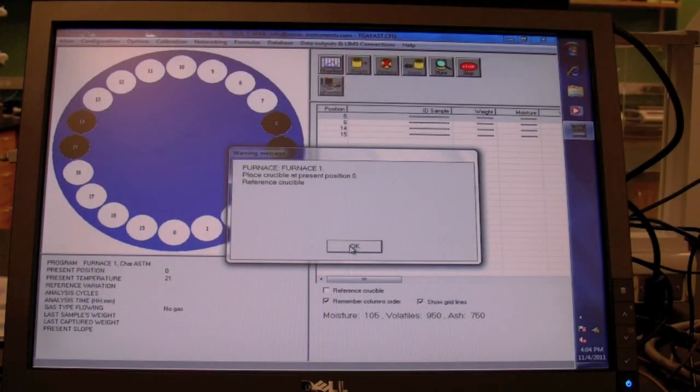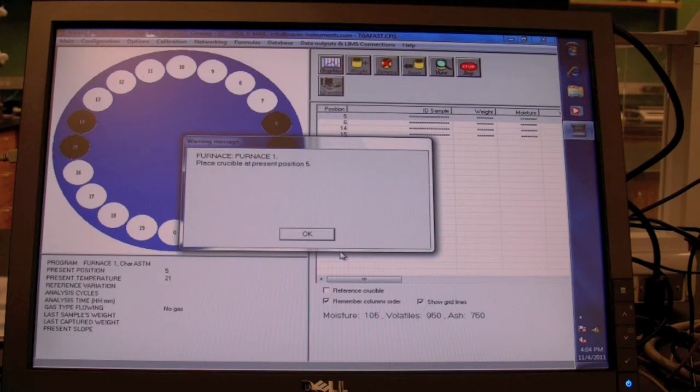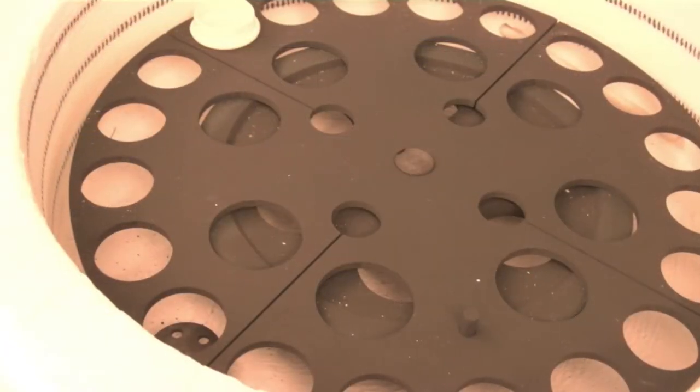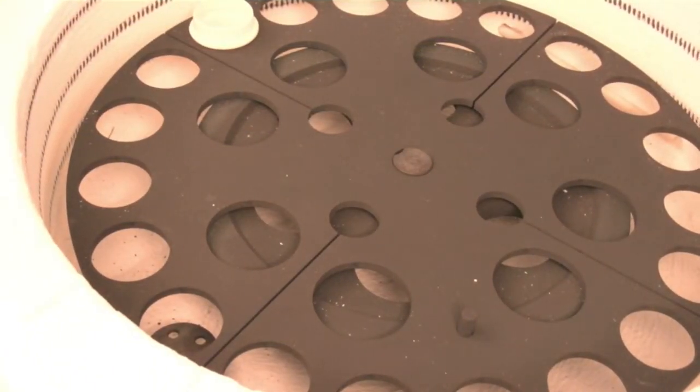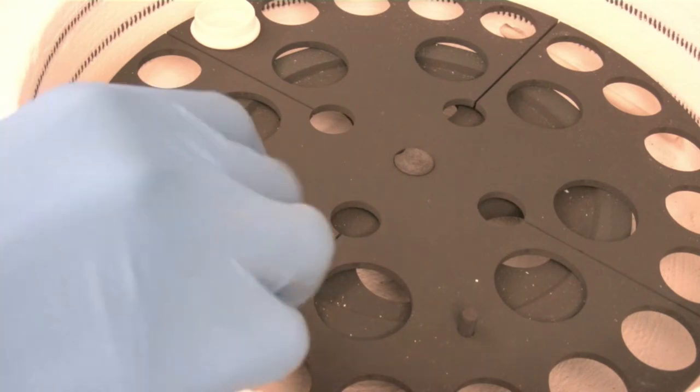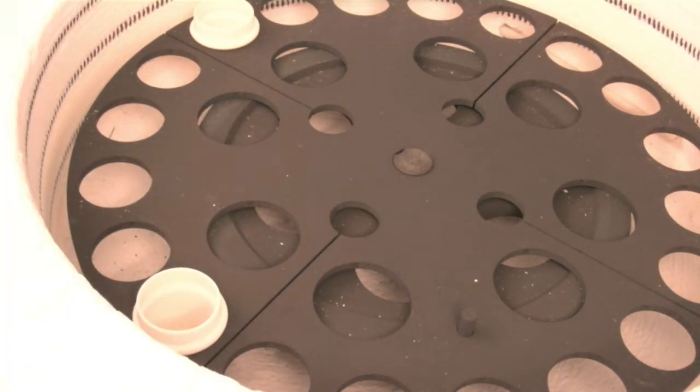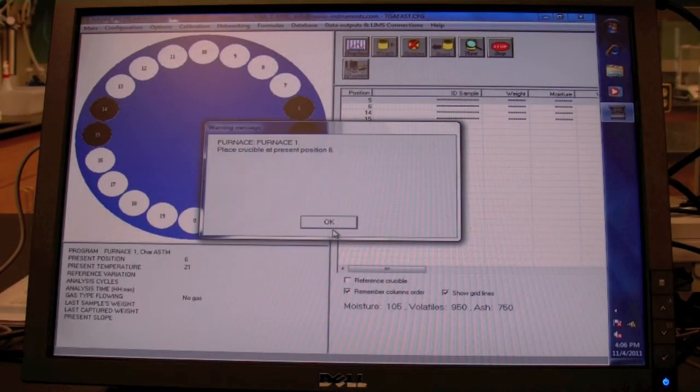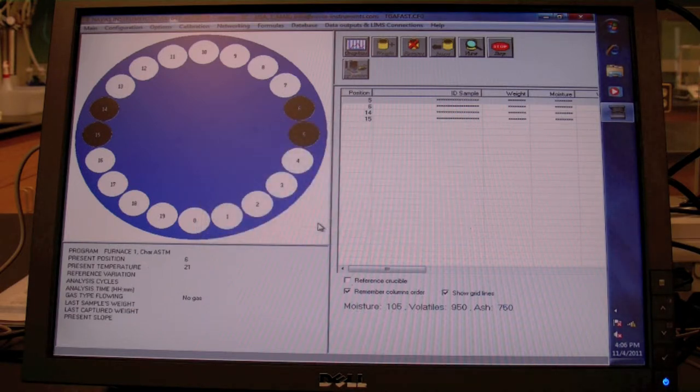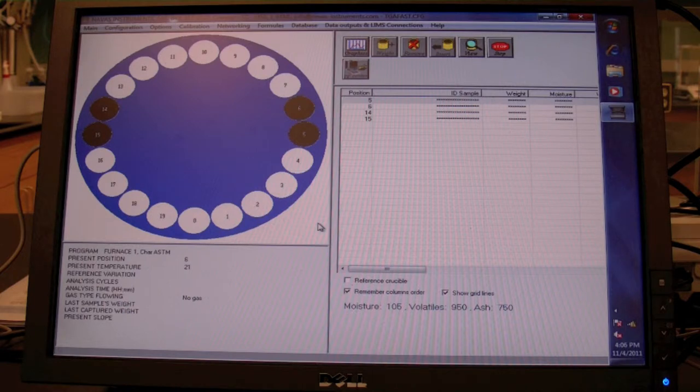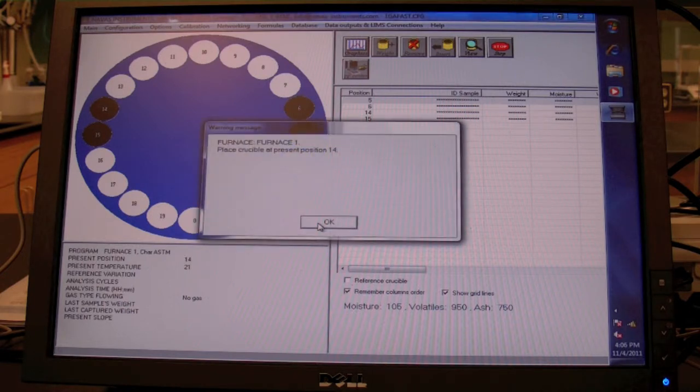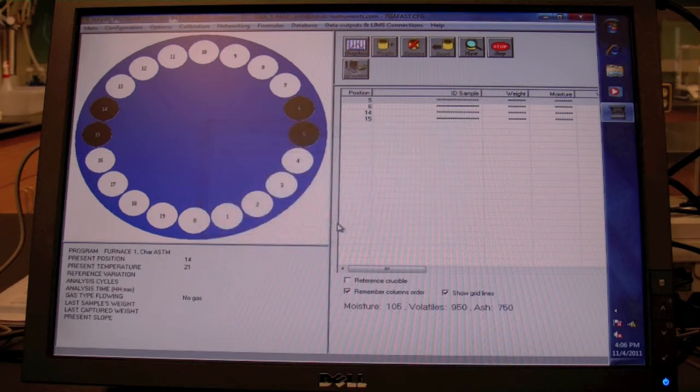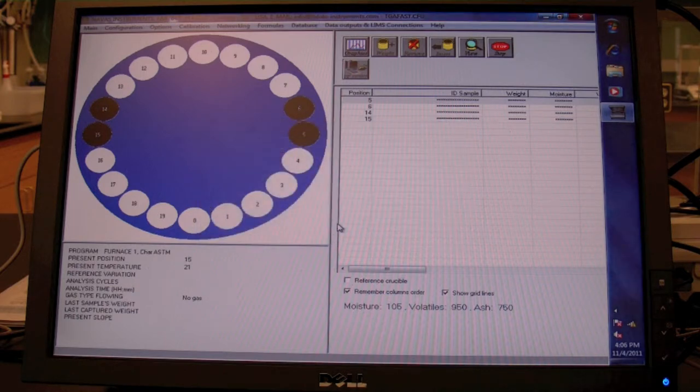Press OK to rotate the carousel so that the next position to be filled is in the home position and pull crucible in that position. Repeat until all needed carousel positions are filled with empty crucibles. After the last empty crucible has been placed, the lid should close automatically to measure and record the empty crucible weights and then reopen so that the samples can be loaded.